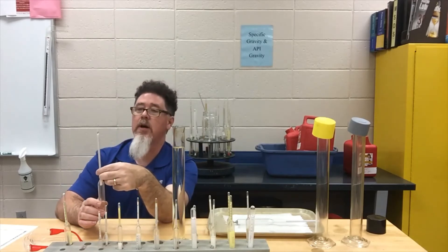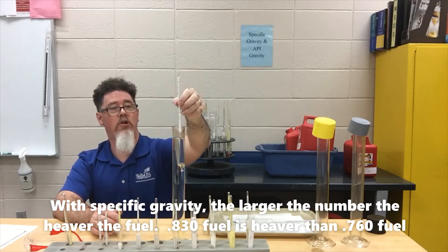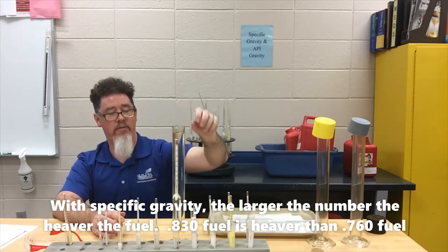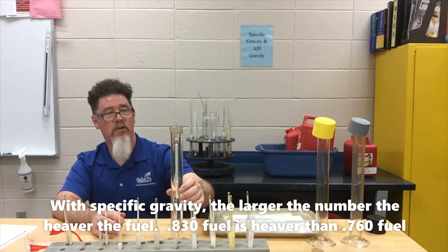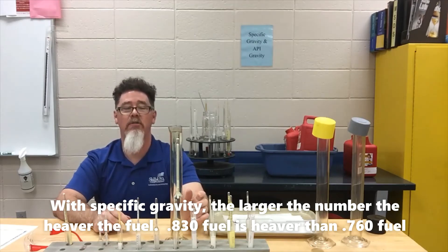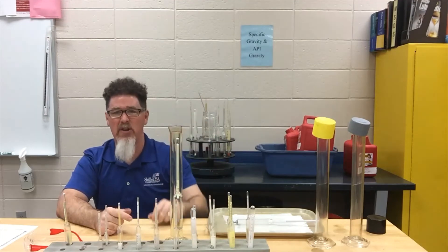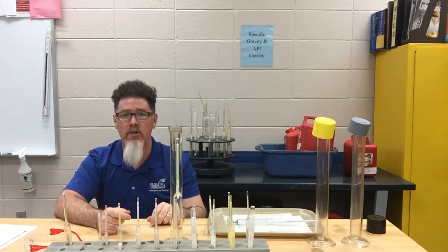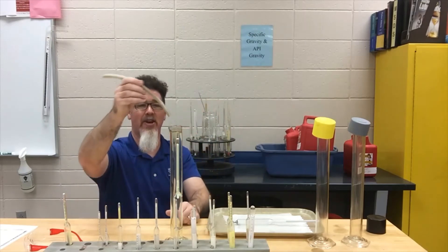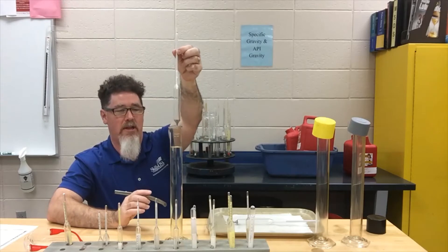This next hydrometer goes from 0.760 on the light end to 0.830. Slowly lowering it in — and it went all the way down to the bottom, so that one is too heavy. So my reading is somewhere between 0.710 and 0.760. I wanted to show you an example of one dropping to the bottom. To retrieve it without sticking your fingers in the fuel, you use a rubber hose as a special tool — stick it in and it grabs the hydrometer.